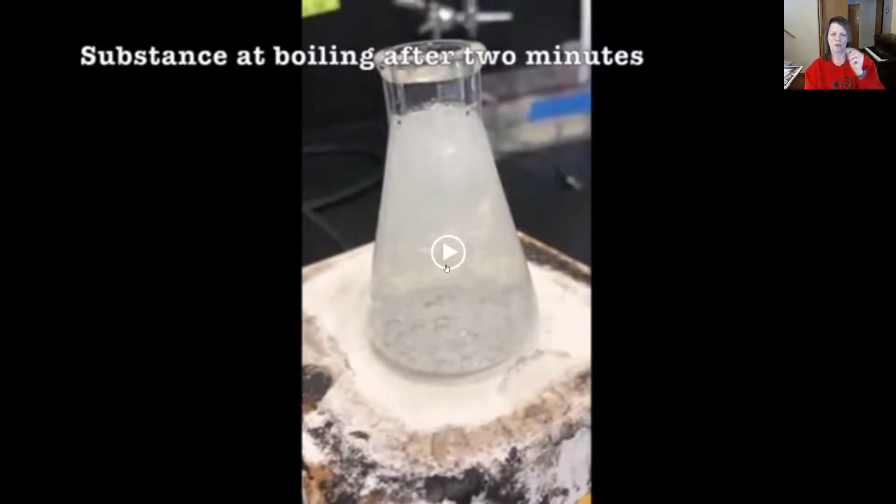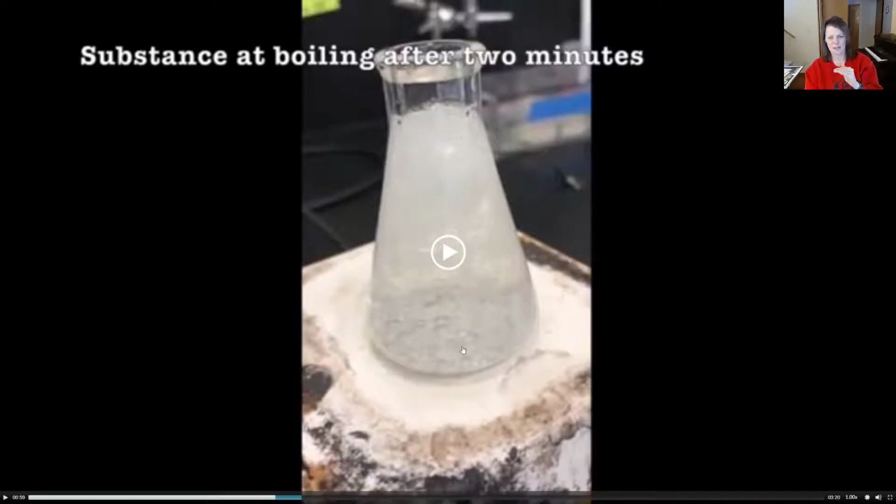Please note that when you're using a thermometer in the flask, please do not let the thermometer go down to the bottom and make contact with the hottest part at the hot plate. You're going to want to keep that thermometer bulb in the center of the flask so that we get the overall average of the temperature of the fluid that's within.